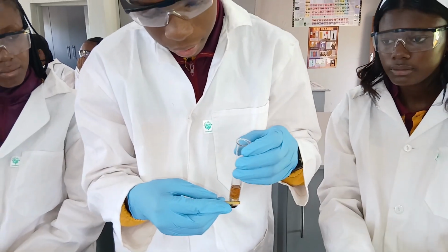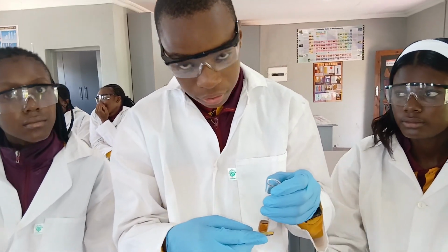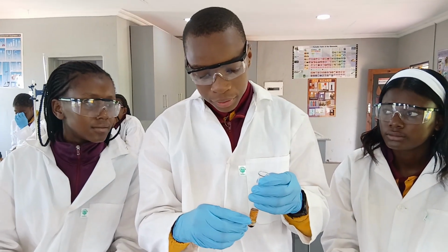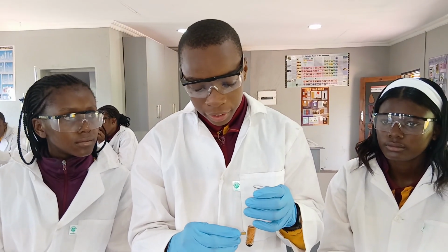If we grab our pH scale, the color of this is orange, which means it is acidic, and it has a pH value of 3.